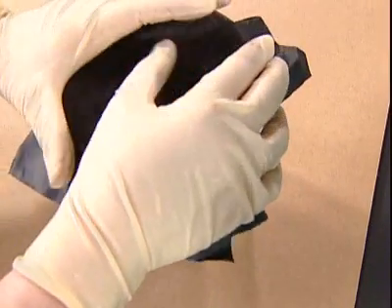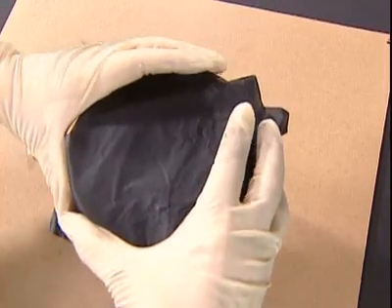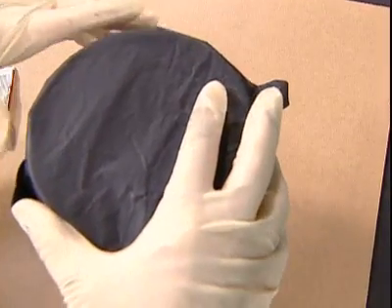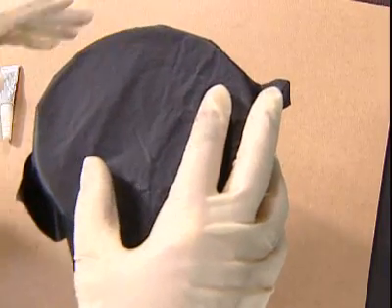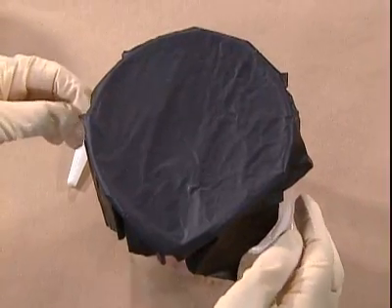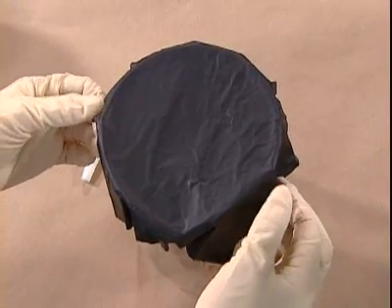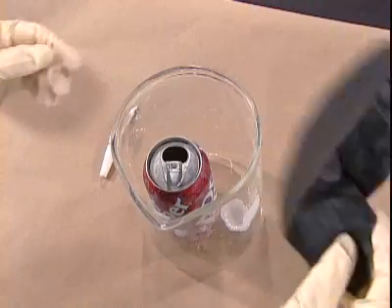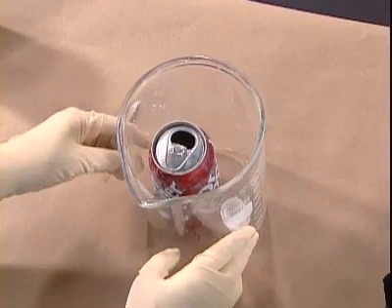Then covering up the tank so that the superglue fumes will have a chance to react and coat the latent. It will be set aside for about 15 minutes. Okay, this superglue tank has had a chance to run for about 15 minutes. It's filled with superglue vapors. They've covered any latent fingerprints. So we'll take a look at what now has occurred inside here.